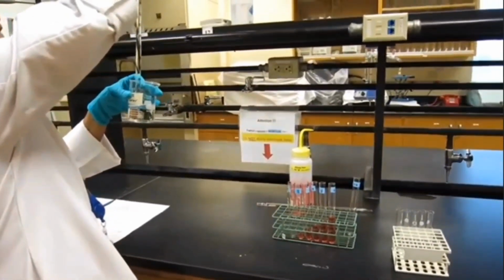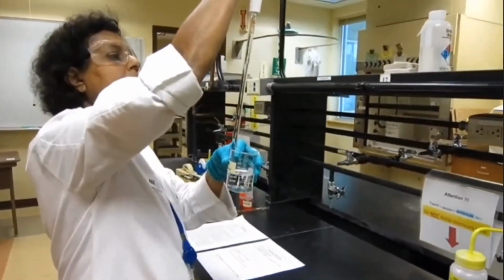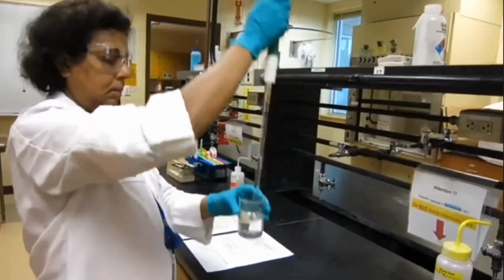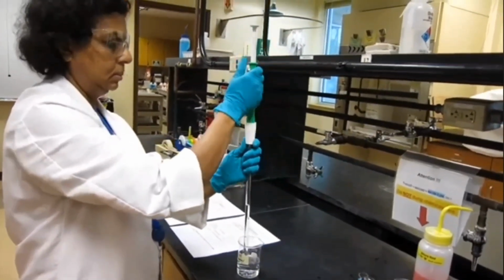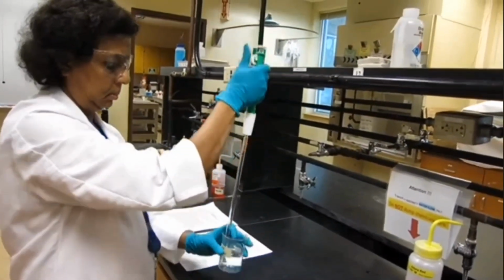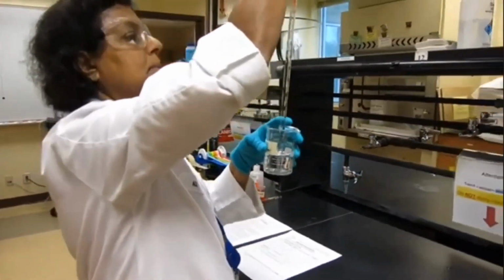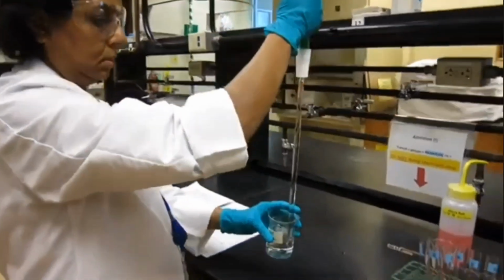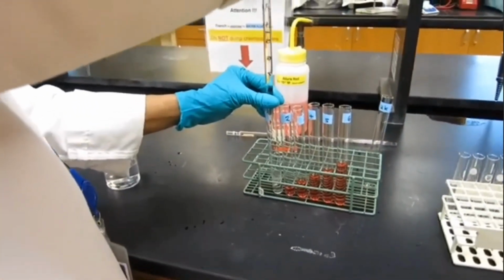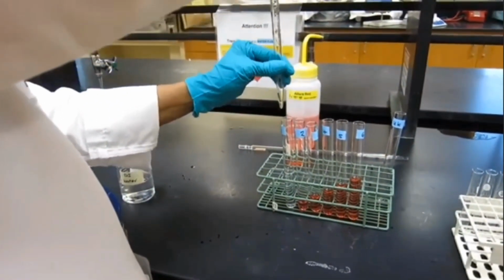So we're going to be adding 10 milliliters of water to the first one, and we have 2 milliliters of Allura red in the next one.